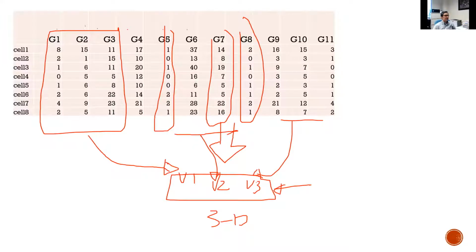So this is not a simple collection of representative columns, but we need an algorithm to compute the main components out of this variable space to find the most representative axes, to use as the variables to describe the diversity and the variation among these data points. Okay, so that's our analysis goal.